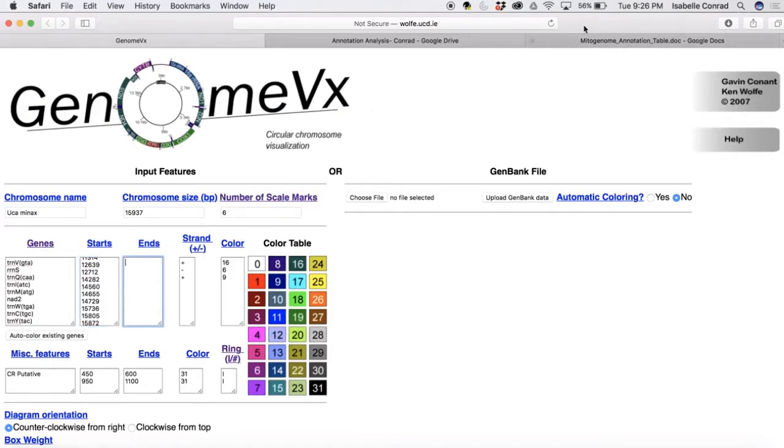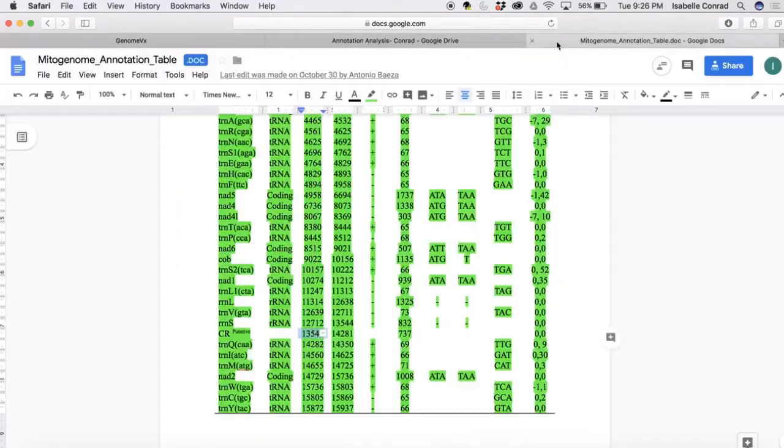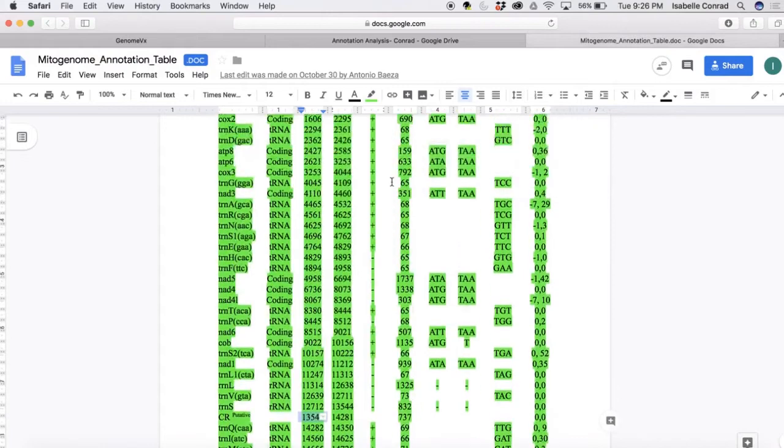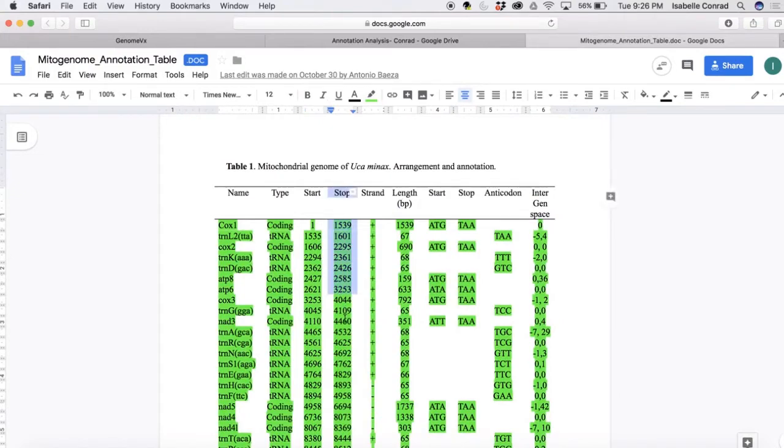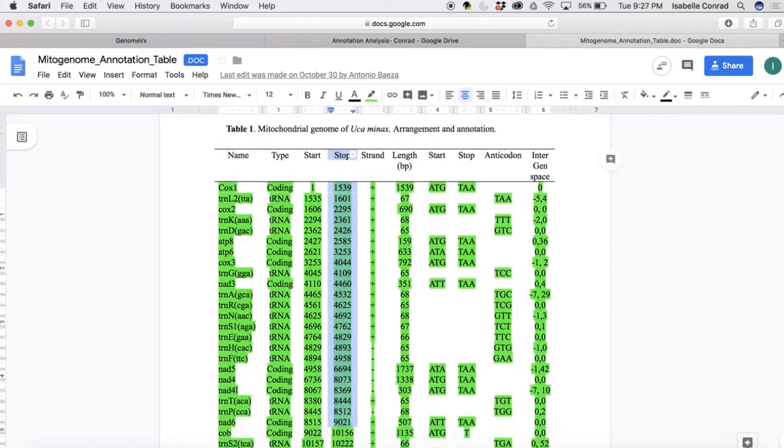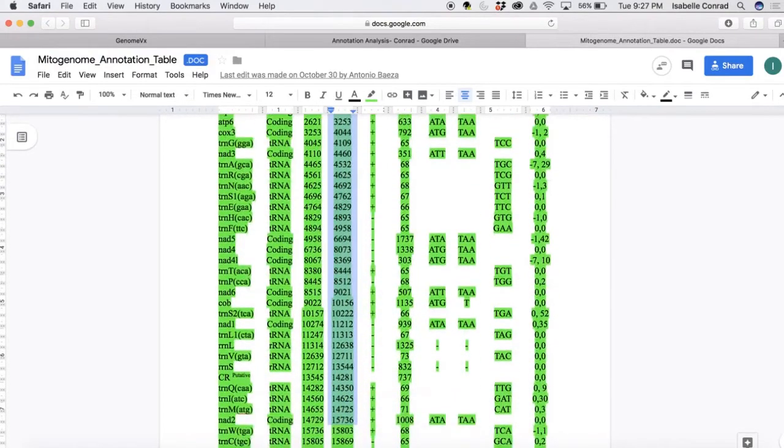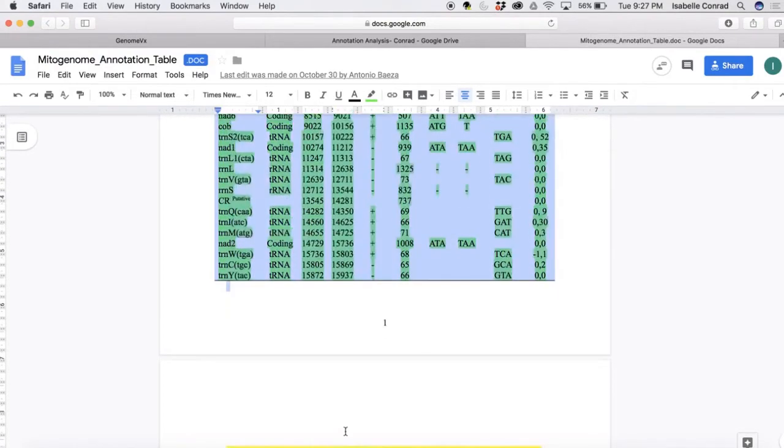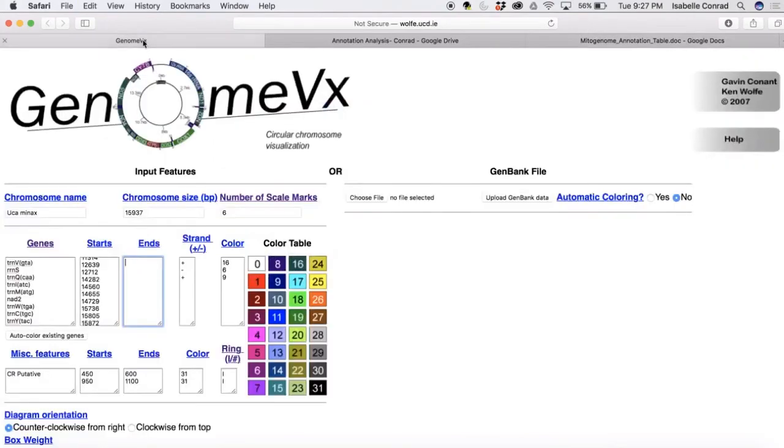Now we're going to go paste all of the end nucleotides. So go find that in the annotation table, copy that, and then we're going to go paste it back into the website. Delete the extra space.